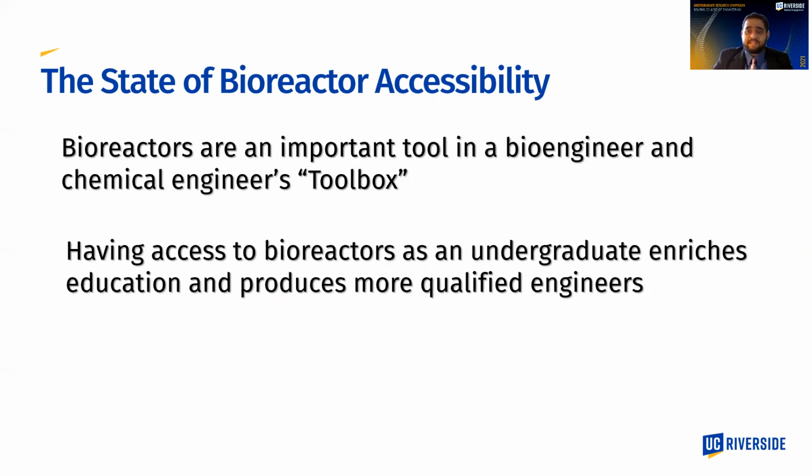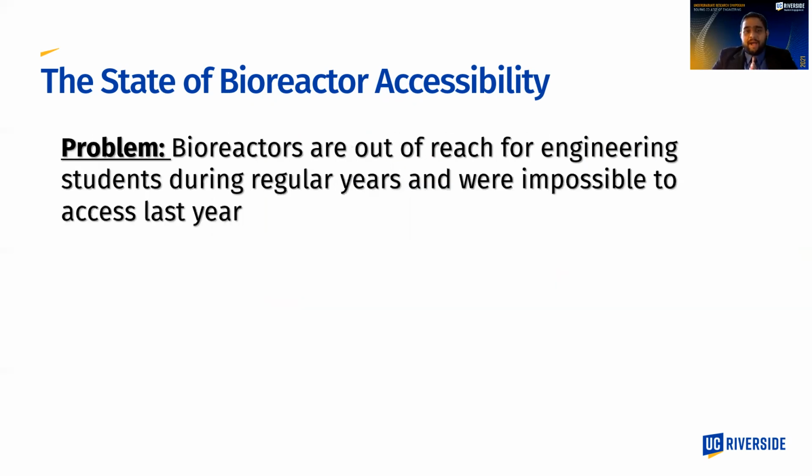And by having access to these tools, undergraduates can not only learn the technical and operational skills necessary, but can also be more competitive in the workforce. Despite this, bioreactors are incredibly expensive. And during a regular year, having access to a bioreactor as an undergraduate is difficult. But during the last year, during which the pandemic forced the campus to close, it was near impossible.